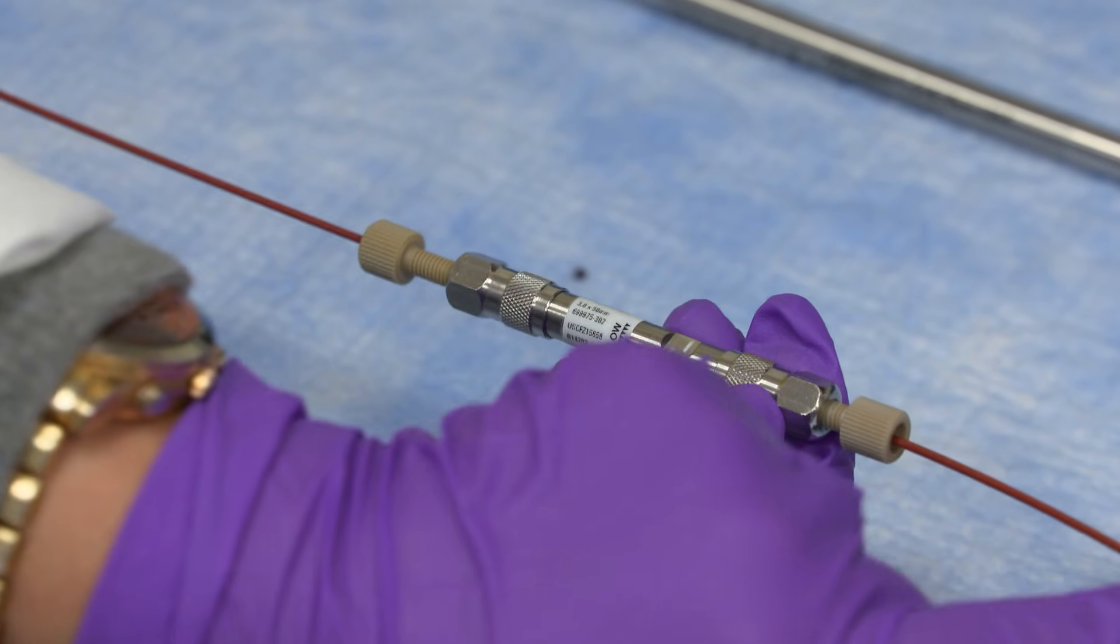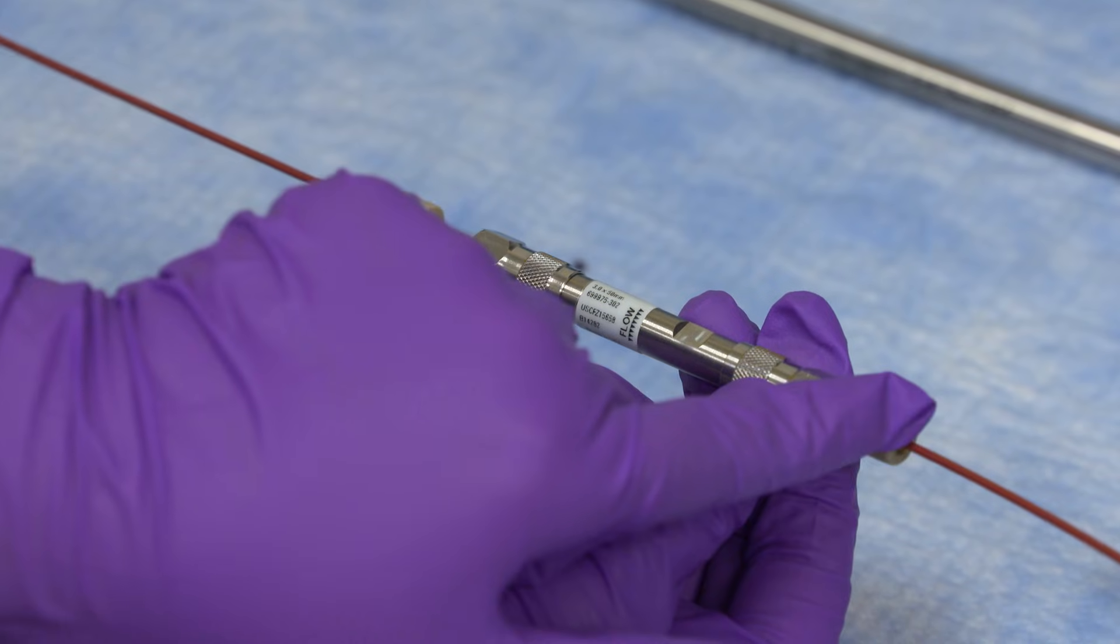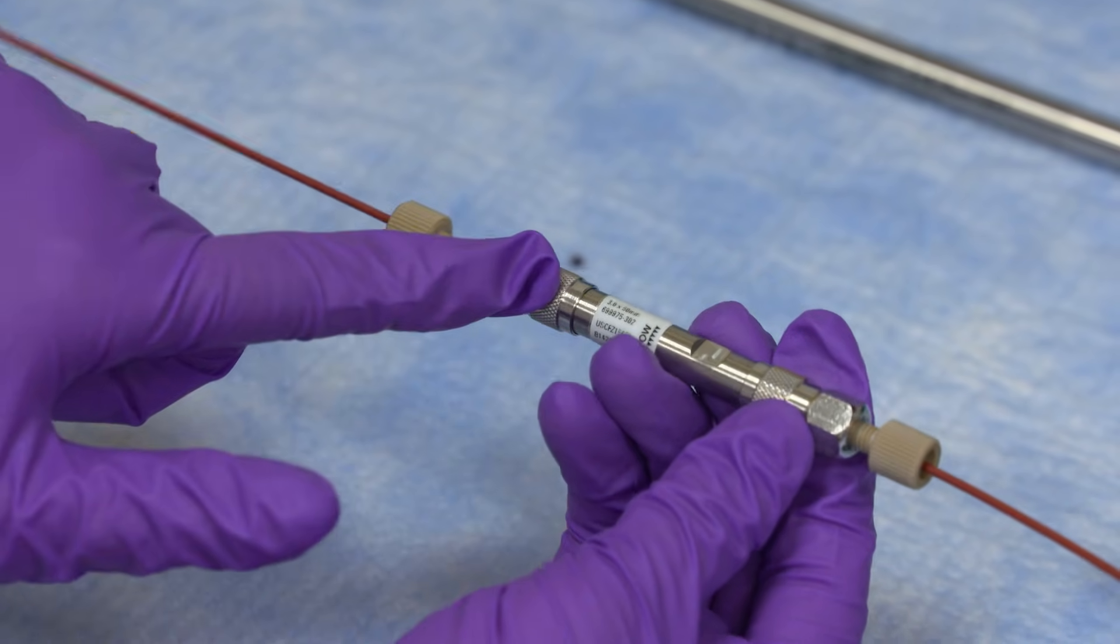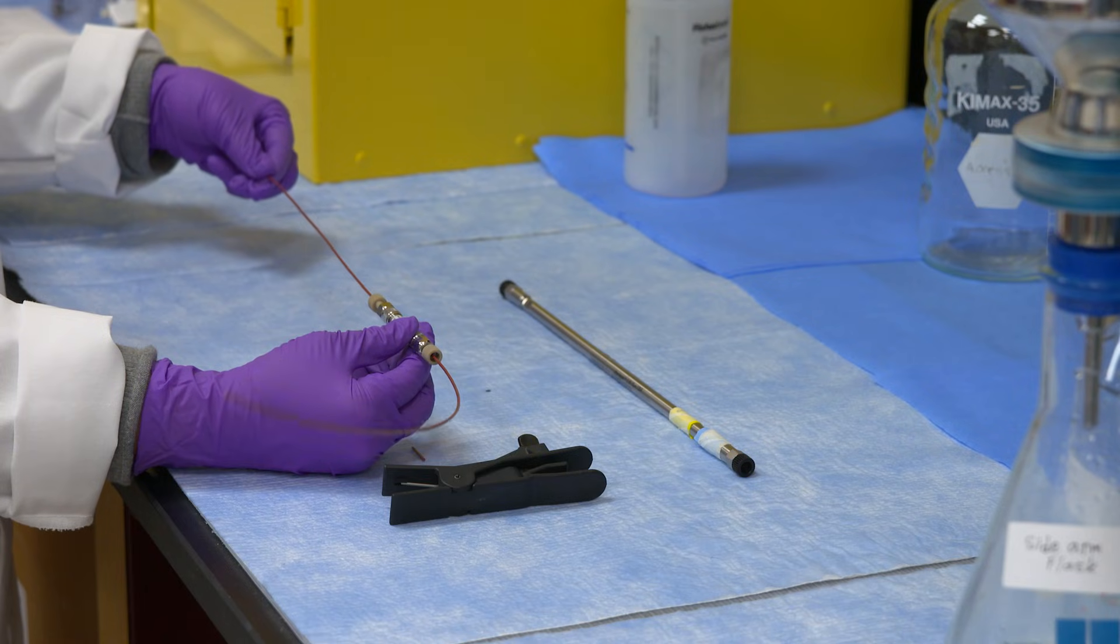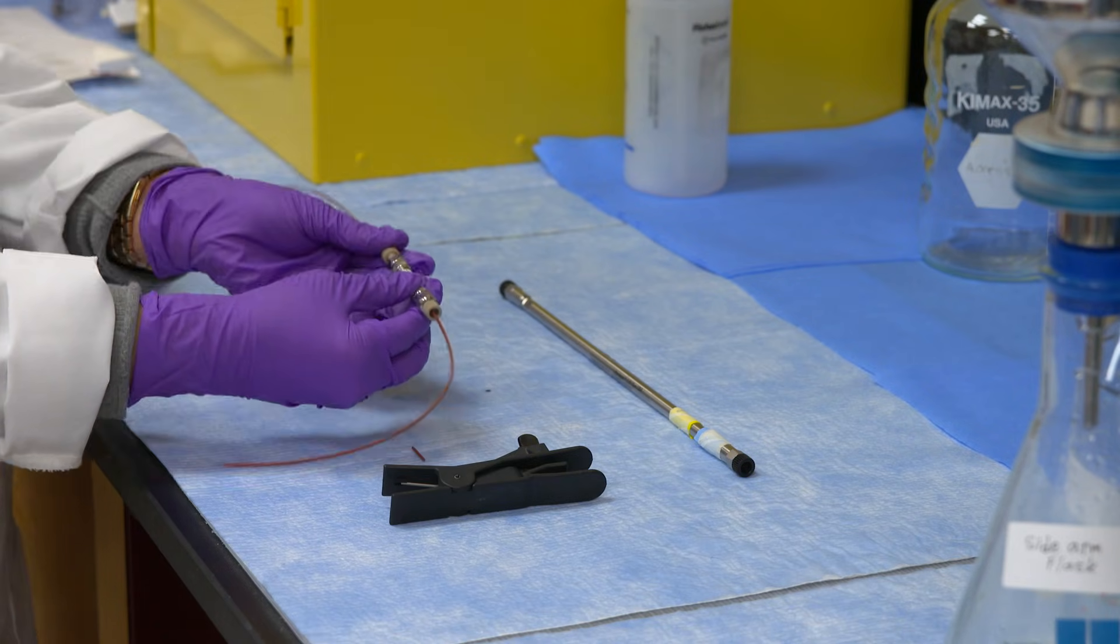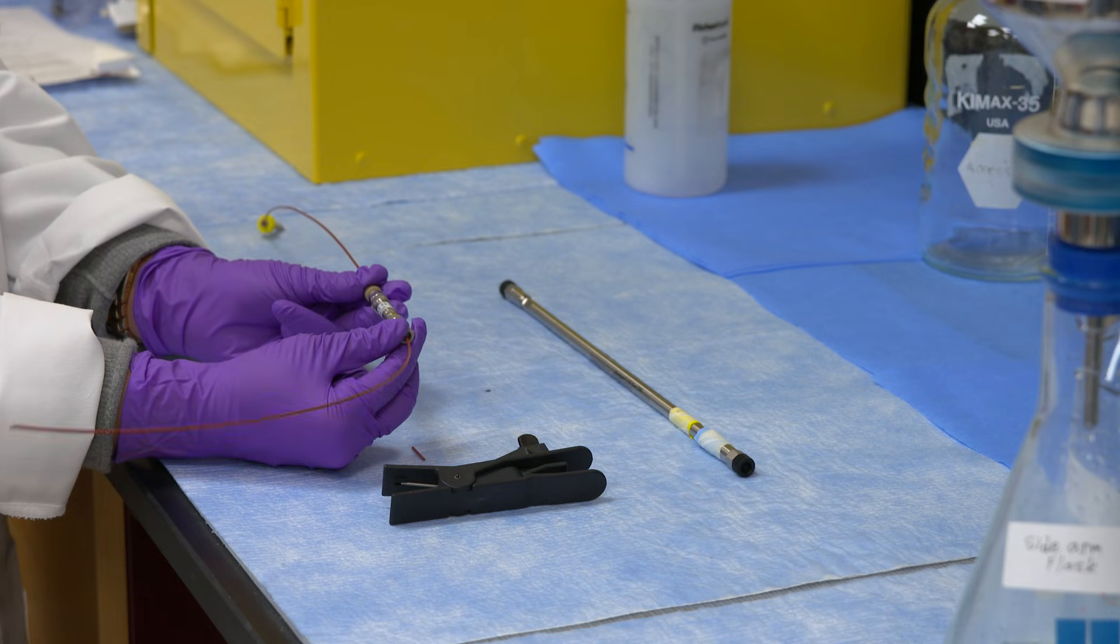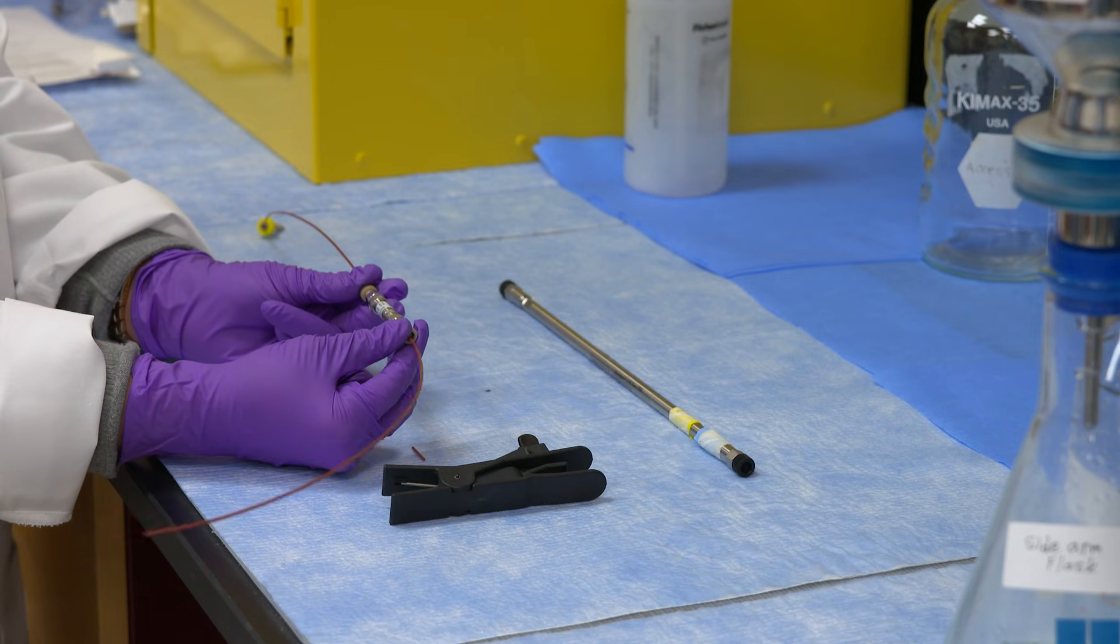Once the flow of solution comes in, then it comes out from this end of the ferrule out to the detector for it to be analyzed. Now this column is ready to be installed in the HPLC system.